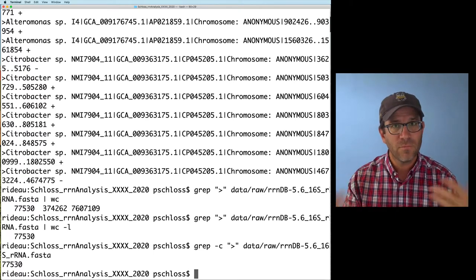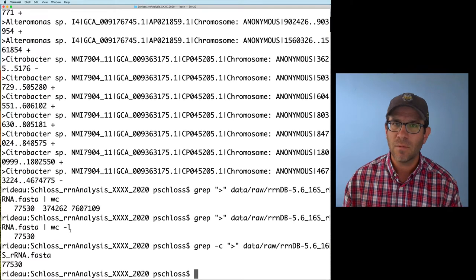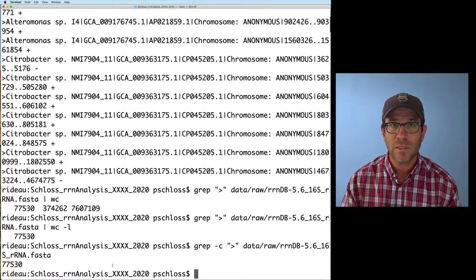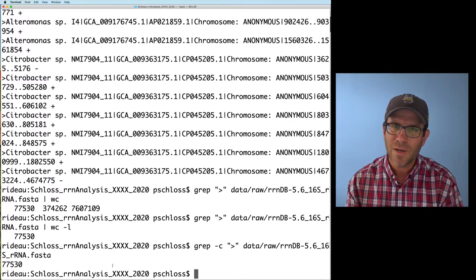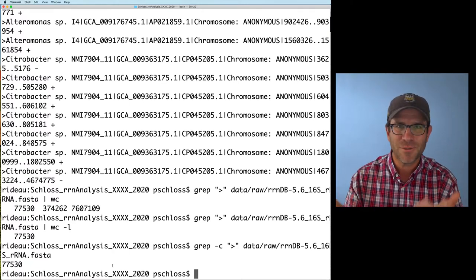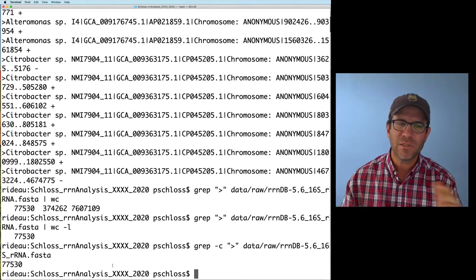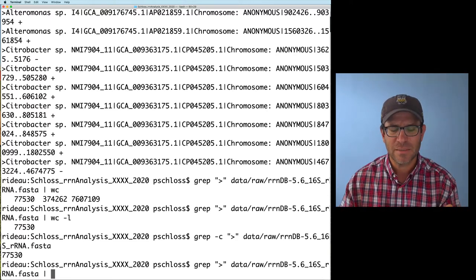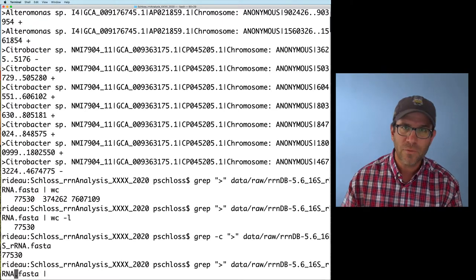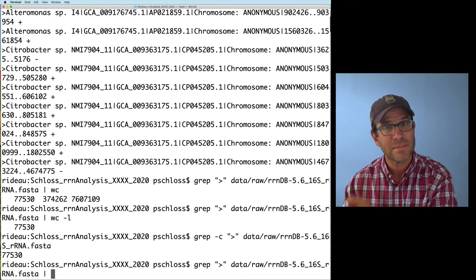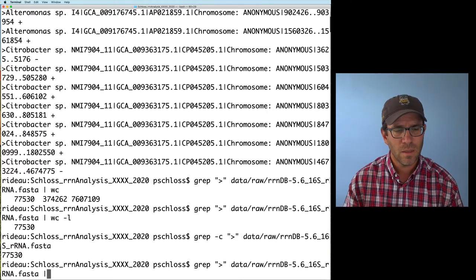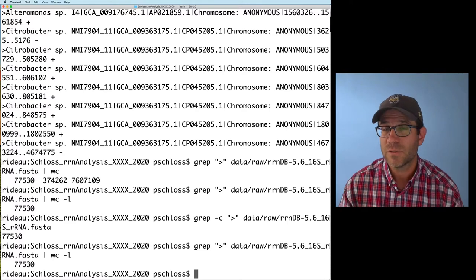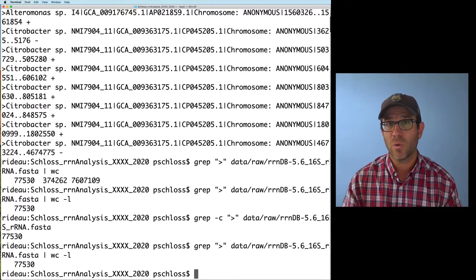In my own use, I go back and forth between wc -l and grep -c. I'll frequently use wc -l more often because when I'm building out a pipeline, it's easier to remove the wc -l at the end and continue the pipeline. If I had grep -c, I'd have to go back and delete it to output text for the next step. Both give the same result of 77,530 sequences.